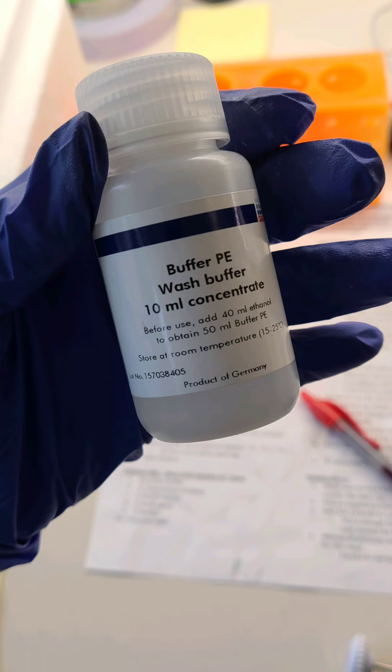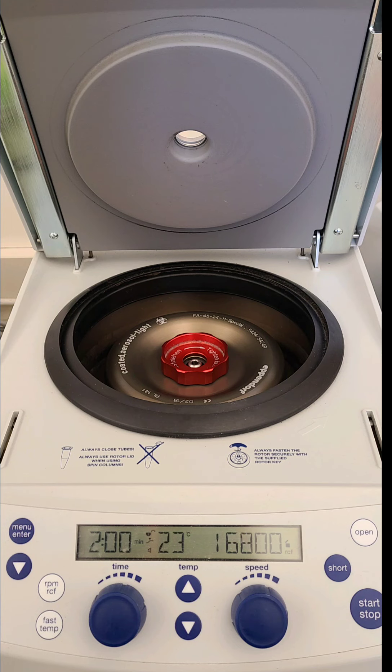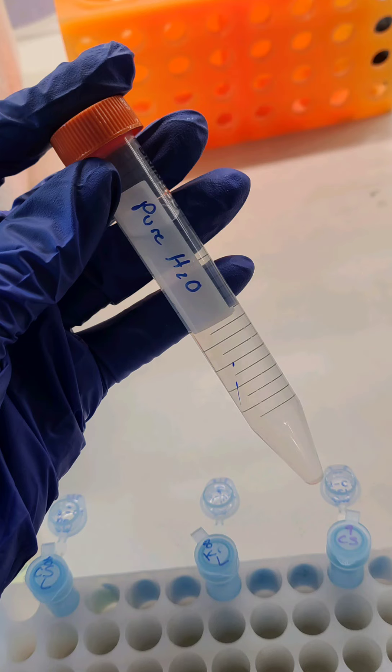We then wash or elute it with buffer PE — it's just from the company. We use 750 microliters there and discard the waste as well. We then centrifuge it for 2 minutes to make sure the column is dry before putting the column onto a 1.5 milliliter tube and adding 50 microliters of buffer EB, or pure water, which is what I'm using here because it works. We let it sit for a minute so the DNA dissolves into it, then spin it down — and voilà, we have our end product that we are going to sequence tomorrow.